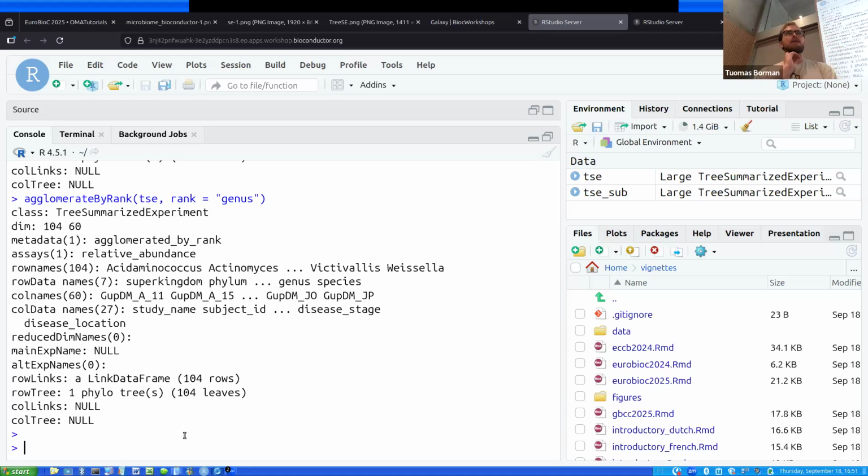Whether it's better to use on rank only as true or false depends on the context, because you are losing information at the end. Sometimes you have a missing value in a specific taxonomy rank, but it's an unassigned genus from a known order or a known class, so it's information that you are missing.